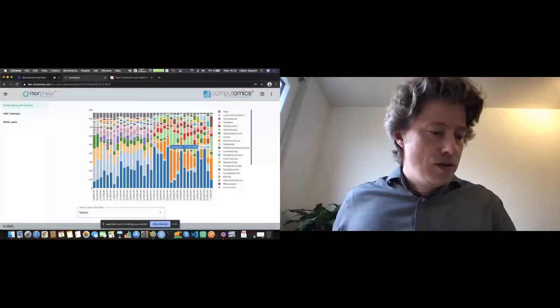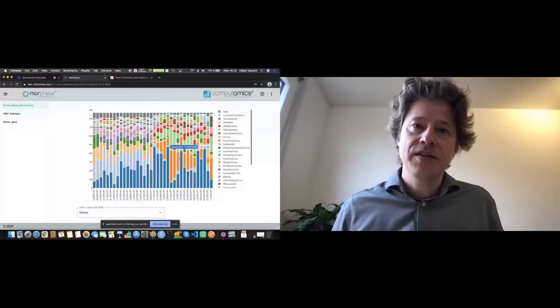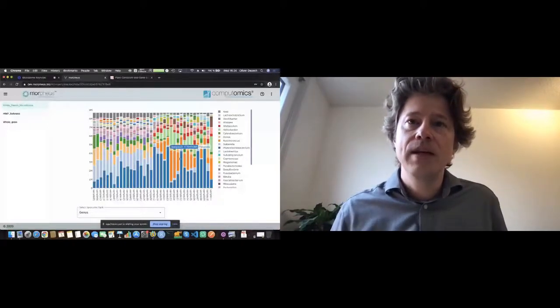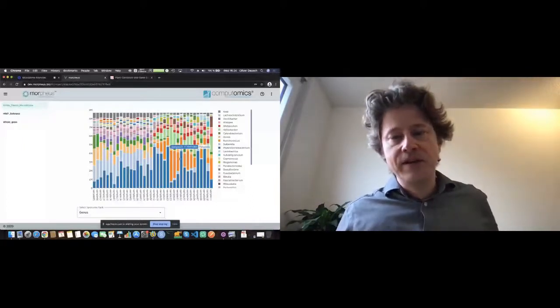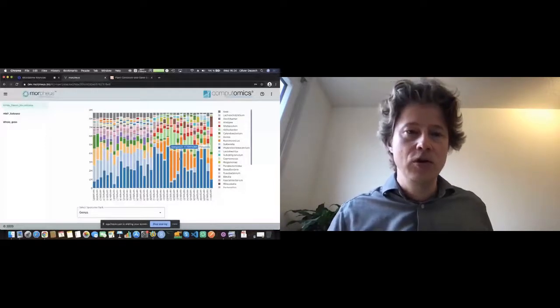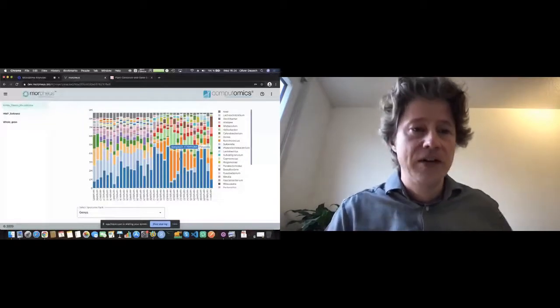And what this really means is that you've just logged onto the system, and this is the first time you're interacting with your data. Once you get your results back, obviously you have to have provided metadata, but you can already draw conclusions, and you're not still wrestling with large sequence files.